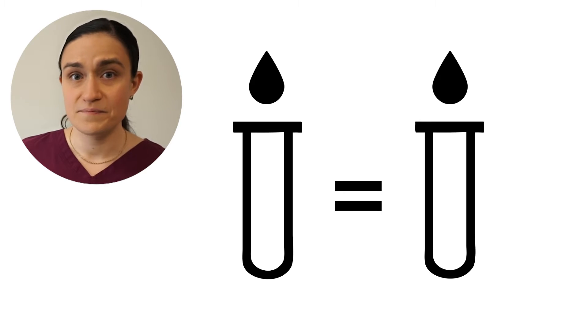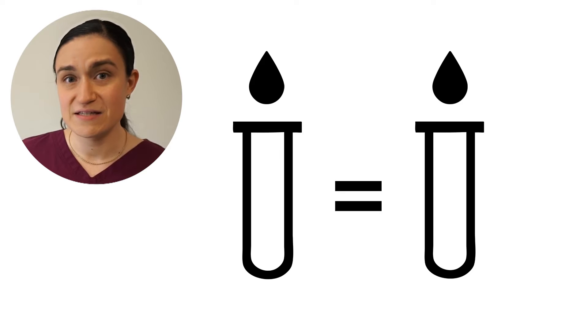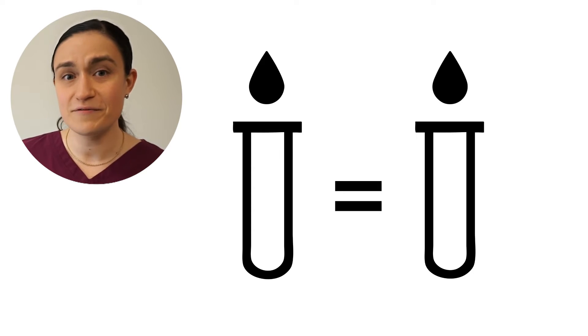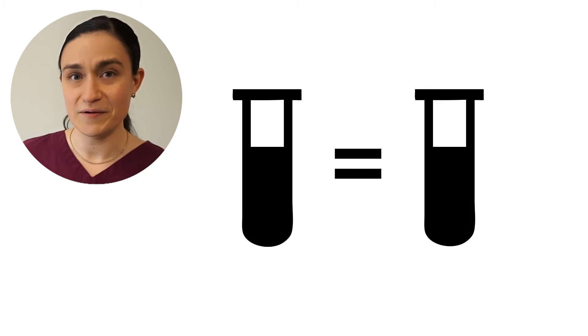If you're only spinning one tube or an uneven number of tubes, you can create a counterbalance by adding an equal volume of water to the volume of blood in the other tubes. Once you've got all of your tubes with equal volume, it's time to load the rotor.